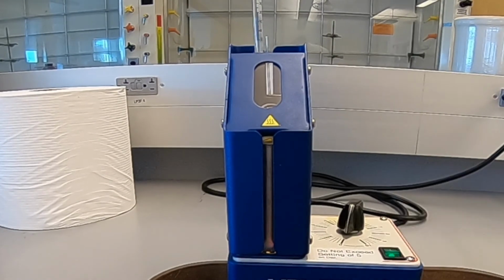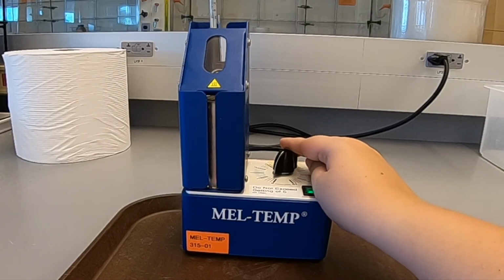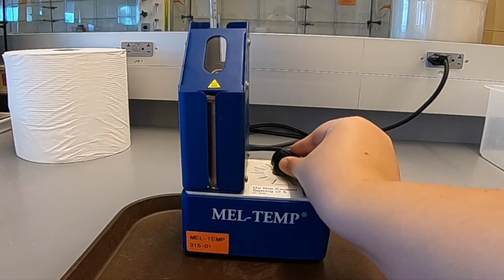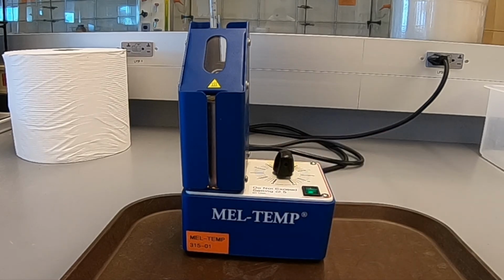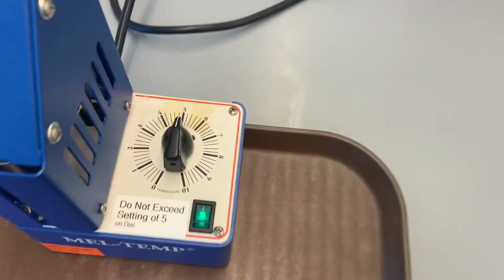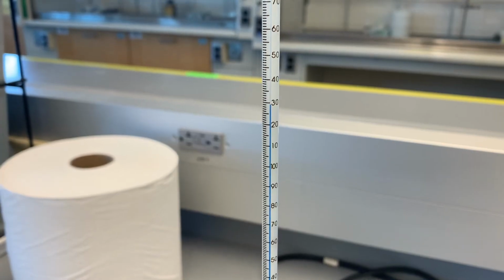Start with the voltage at 0, so there are no surprises. We can then turn on the Mel Temp, which should turn on both the heating mechanism and the light source. Now we can set the voltage control to any convenient setting. This is where knowing the melting point of your substance comes into play. If you have a substance with a higher expected melting point, you can place the voltage control to 4 or 5. If not, stick to 3 or lower.